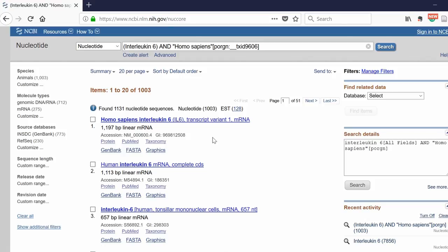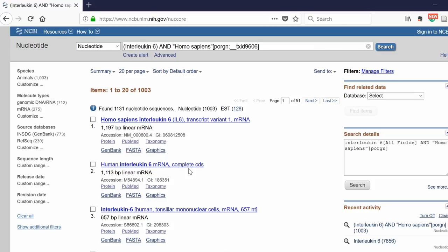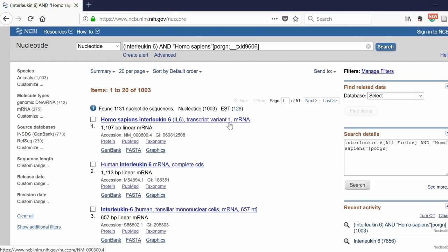What you're looking for is the mRNA. If you see results that have CDS in the name, this stands for the coding sequence. However, this will not contain any information regarding introns. Ideally, when you're designing real-time PCR primers, you do want to contain the introns in the data. So always select the full transcript sequence, the mRNA. Click on this.